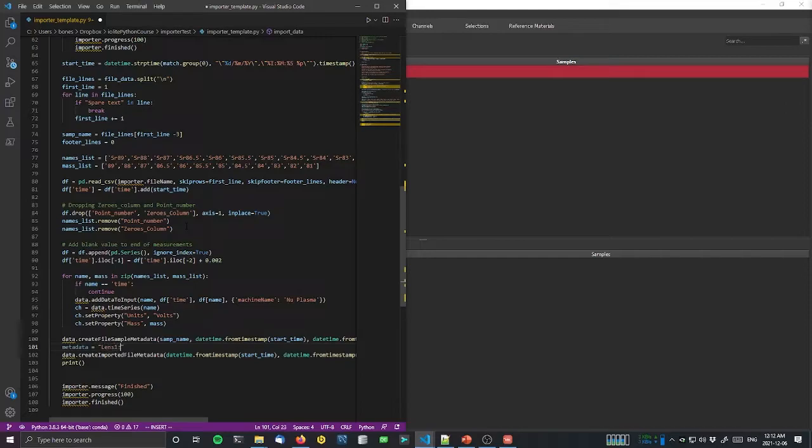1 and put a colon, and let's say that was at 1200, and it's going to be a comma separated list here. So we'll call this lens 2, and that was at 12. We'll say the vacuum was at -1 e to the -3. And that should just about do it, I think. So we'll put this in. Oh, sorry, I've put in a typo there. Okay, so that's our comma separated list of metadata.